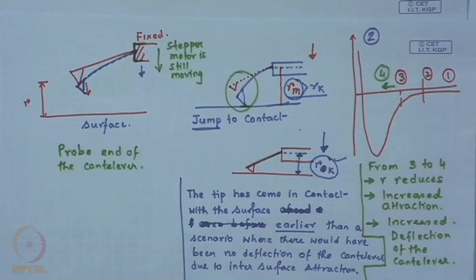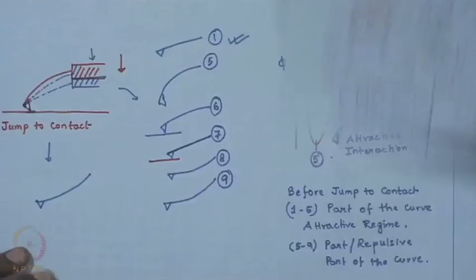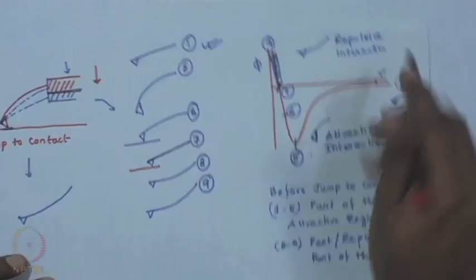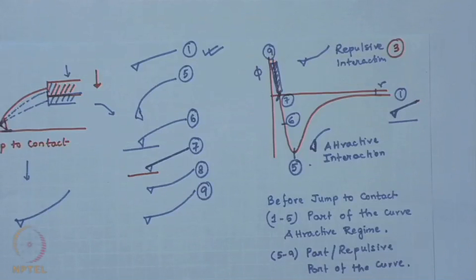But what you now see additionally on this cartoon is something we deliberately did not talk about. I did not want you to get confused, so I avoided talking about it. What we need to understand now is how this deflection gets manifested on the photodiode.